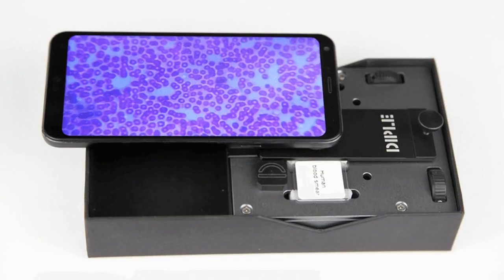Smart Micro Optics' DIPL lens platform turns your smartphone into a microscope. Its 150x lens can allow for up to 1000x magnification when combined with digital zoom.